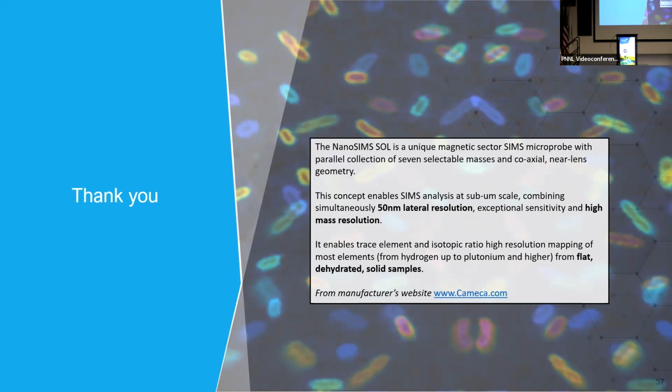Thank you. Seems to be a great technique. I was wondering how well it works to resolve rare earth elements, particularly differences between them, because I've used other methods, like microprobe, before, and our problem was differentiating rare earth elements. No problems at all. I've been working on rare earths in the last month. We've used hybridization probes with rare earths attached instead of fluorescent probes, and it works quite well. And we can use them in concert, using a bunch together. We just have to be careful.